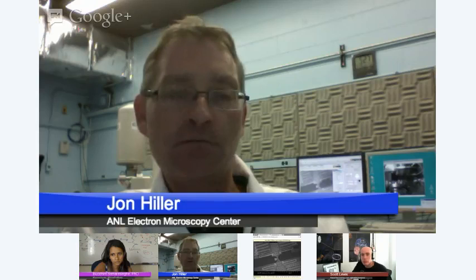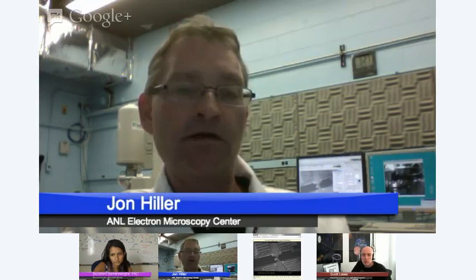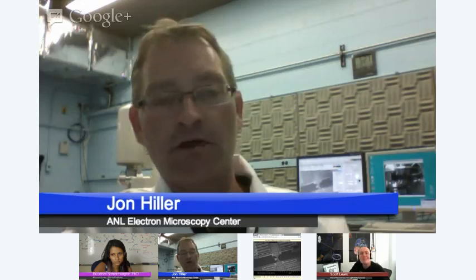Back in the day, we didn't have computers to control them. We had cathode ray tubes and photographic plates for taking pictures. Now you just click a button, go play Angry Birds, come back, and you're done. You have a picture.